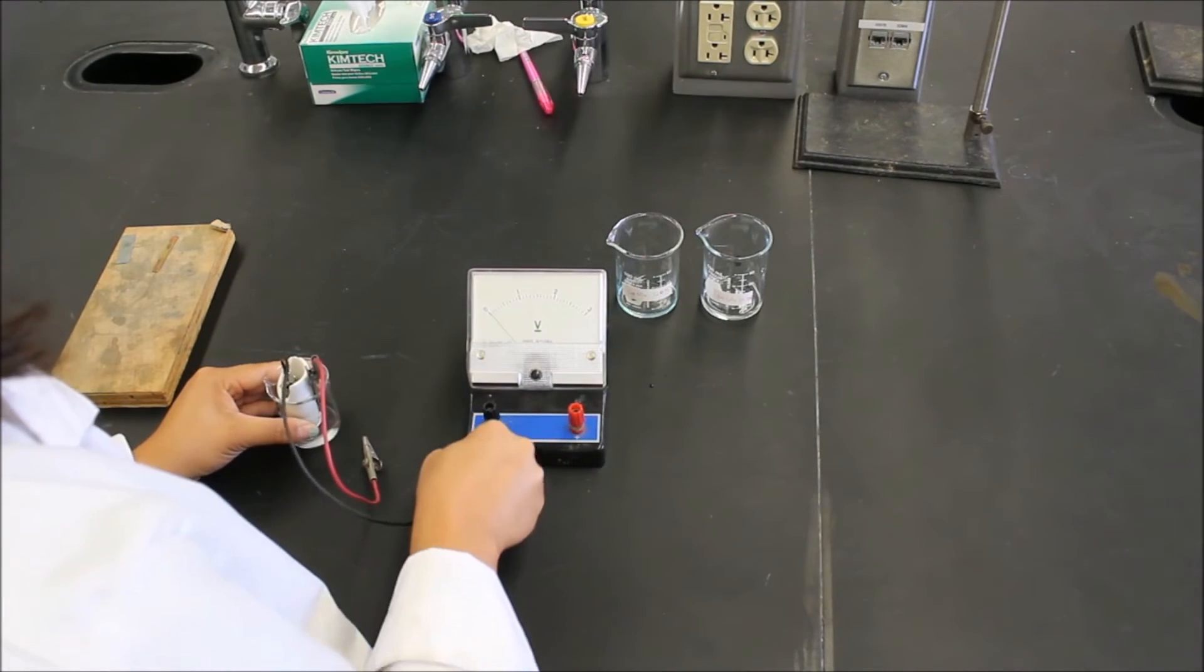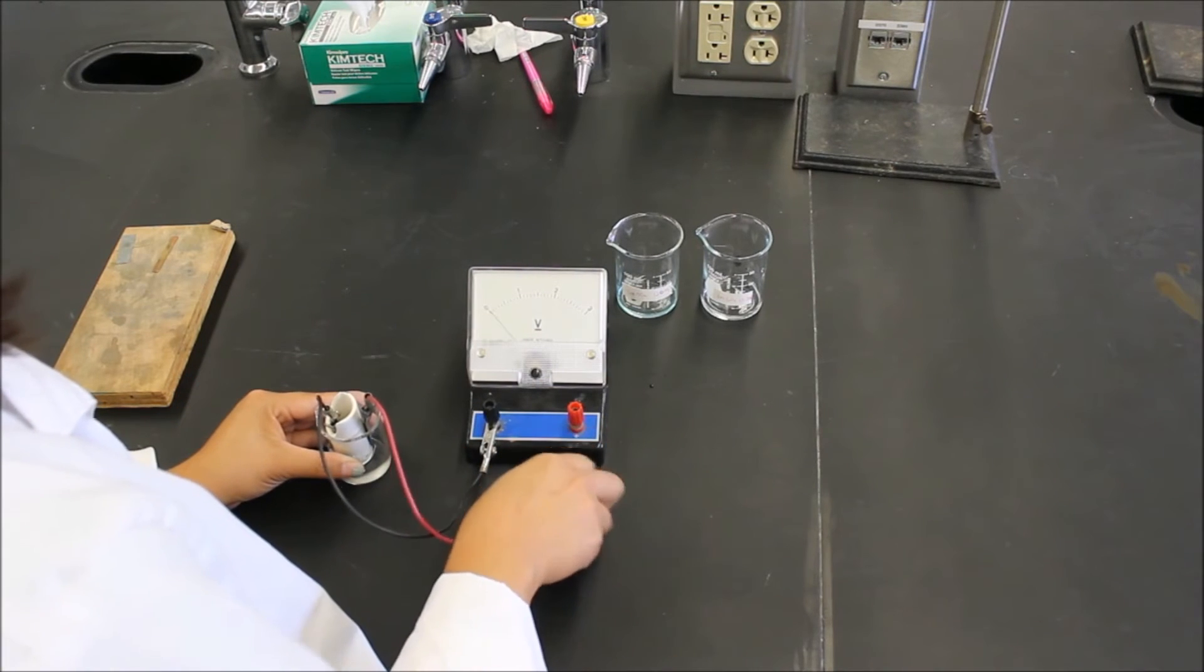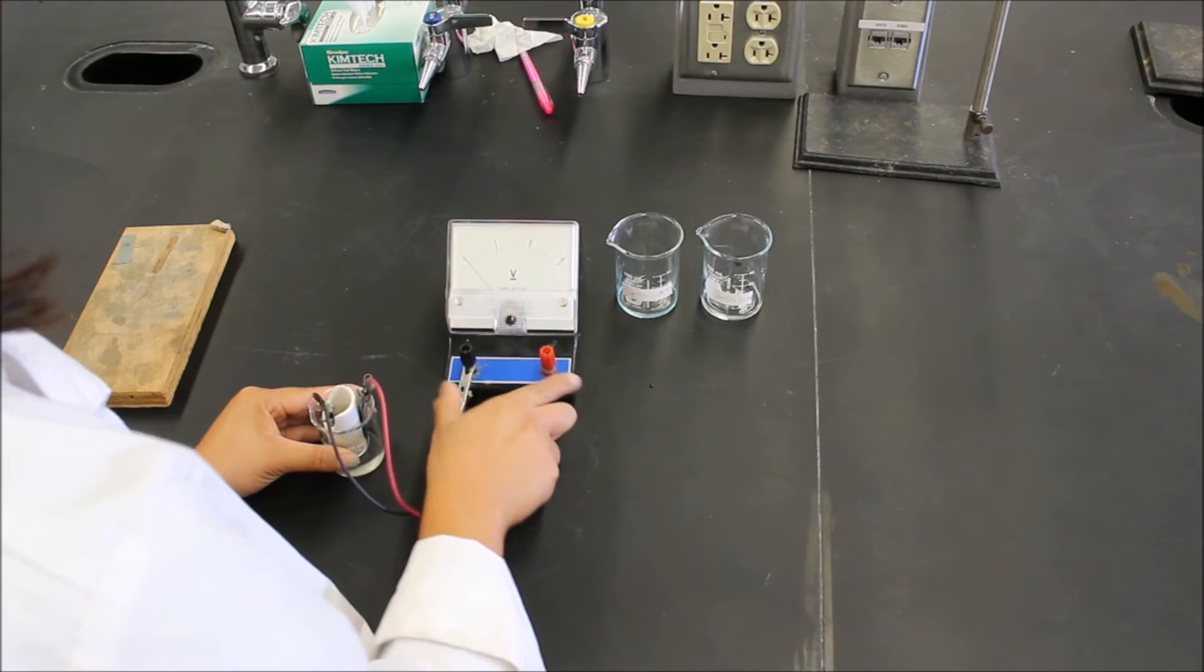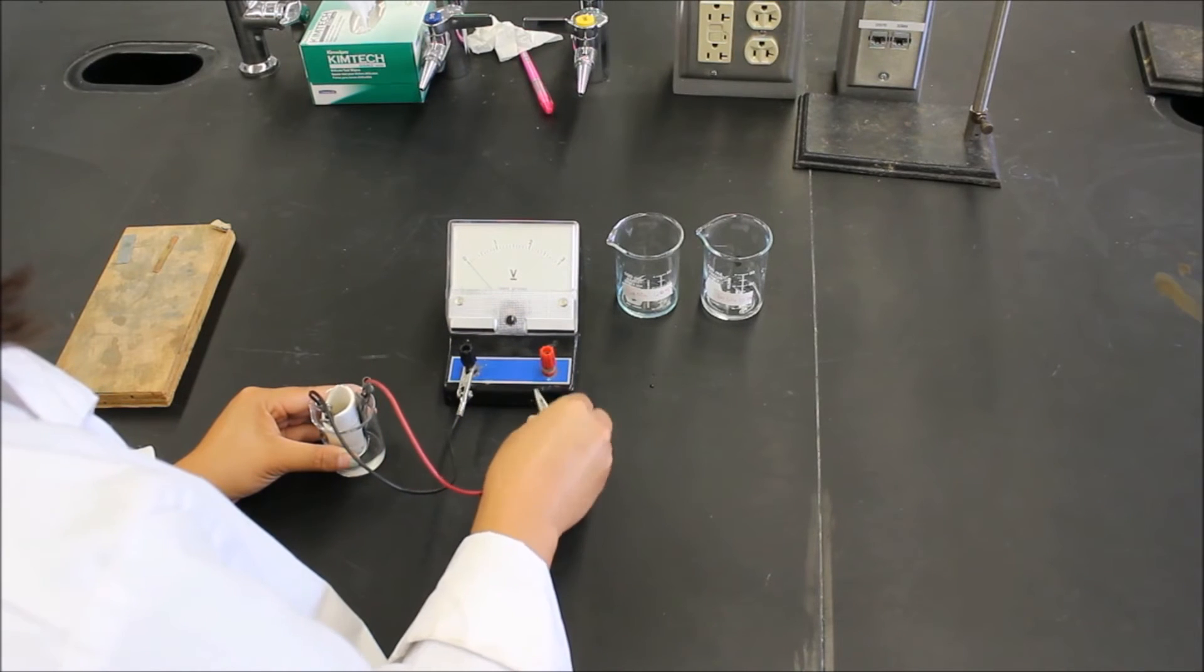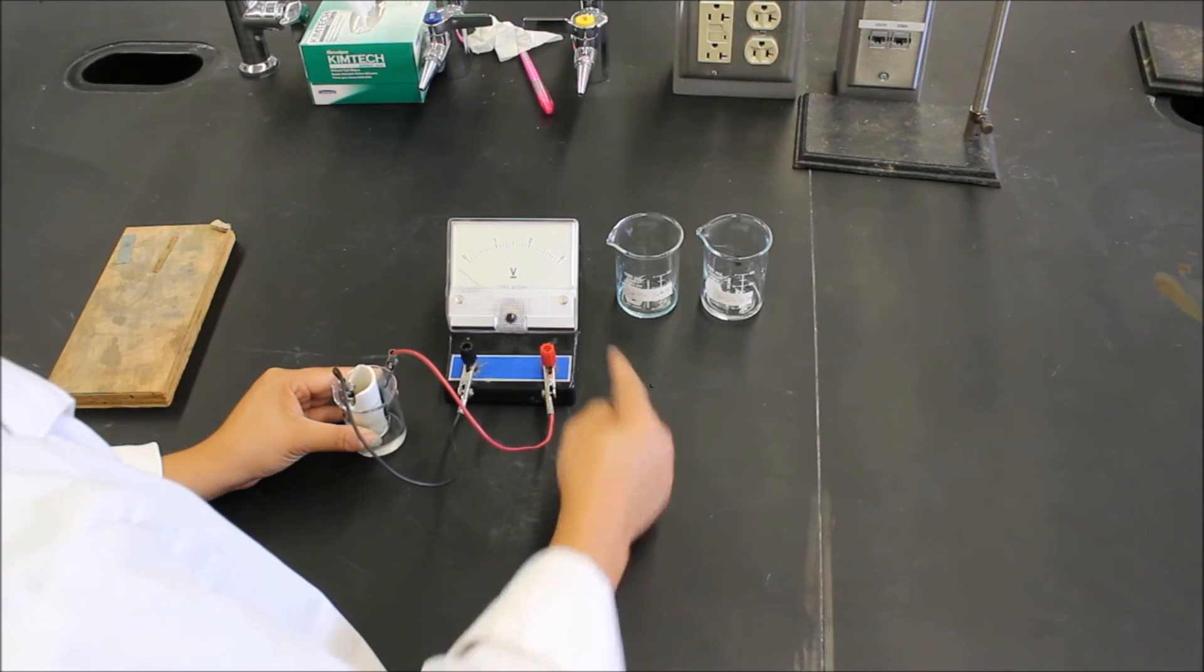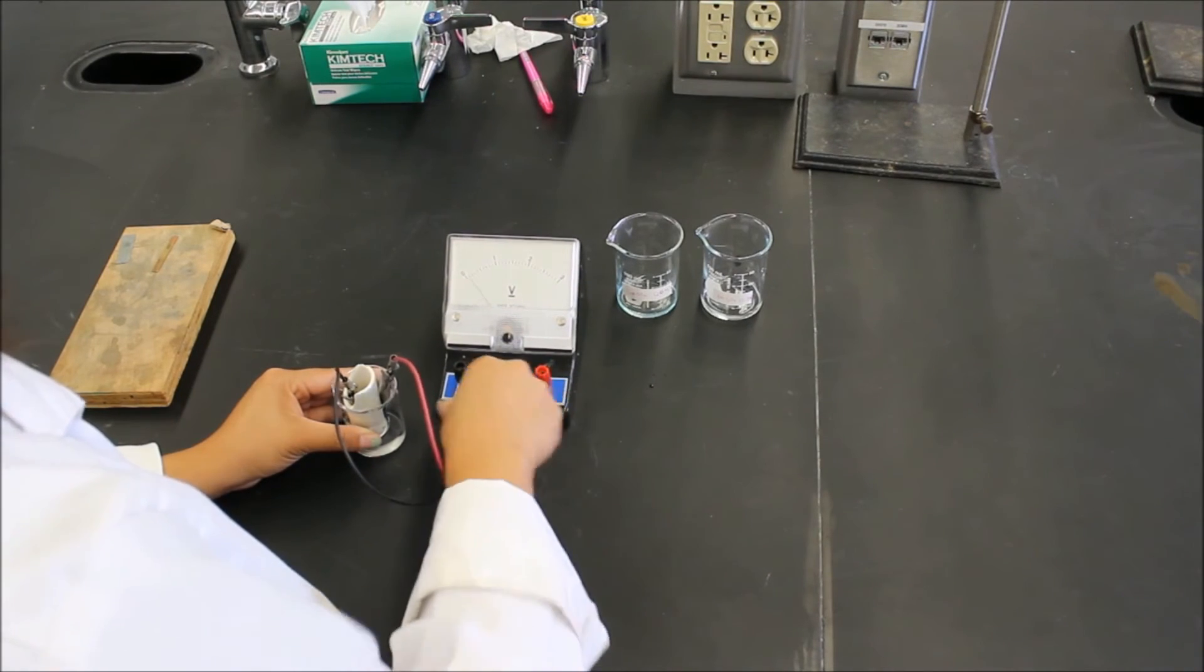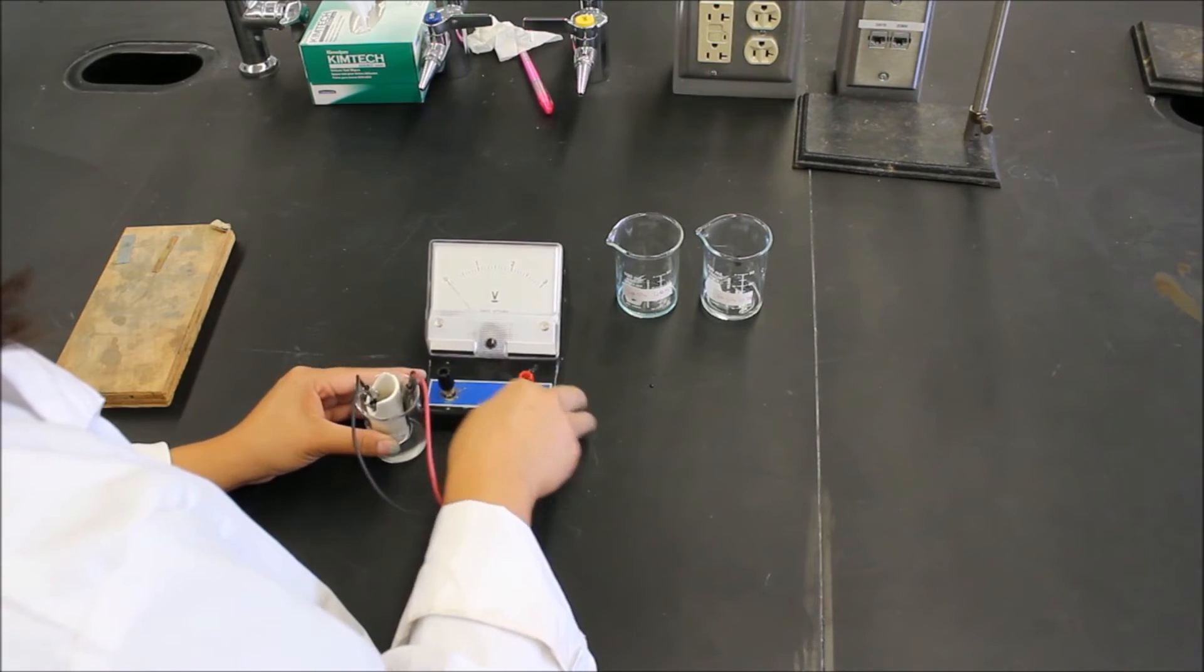Also when you connect these, do note which electrode is connected to which post. You'll see a little positive and negative sign on the bottom of this. Make sure you just write down which one's connected to what. So if you connect them and it's very negative, then you'll want to just switch them up until you get a positive reading on your voltmeter.